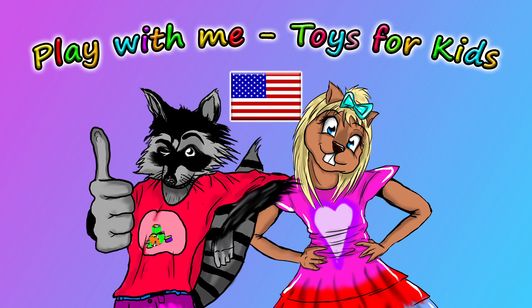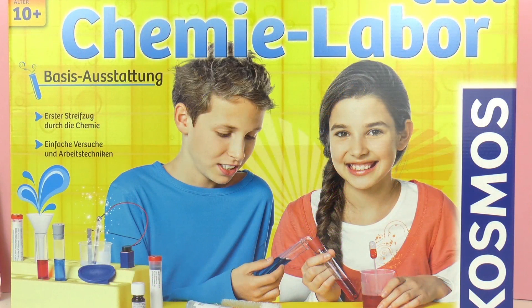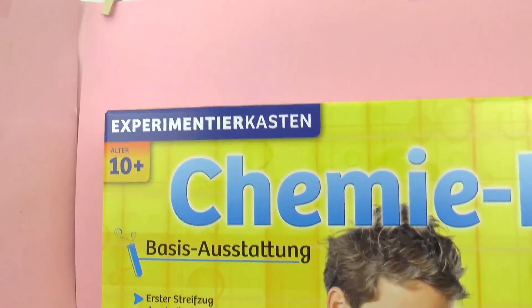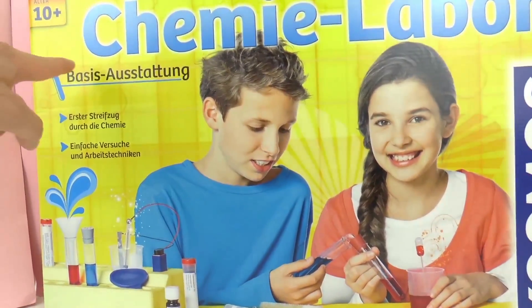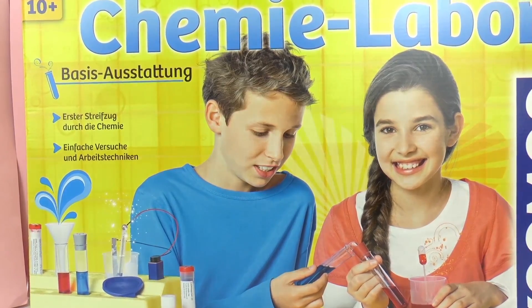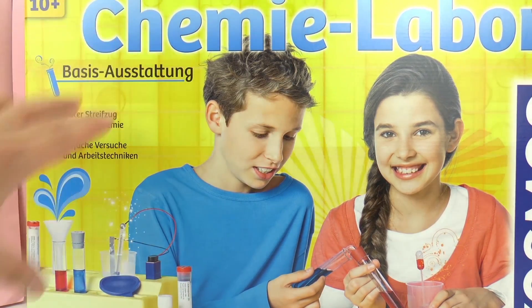Hello and welcome to Play With Me Toys for Kids. Today I'm going to be showing this chem lab from Cosmos. It's recommended for ages 10 and up. It looks like there's a lot of fun experiments that we'll be able to do with this kit. Today we're just going to be doing an unboxing but stay tuned to see more experiments as well.